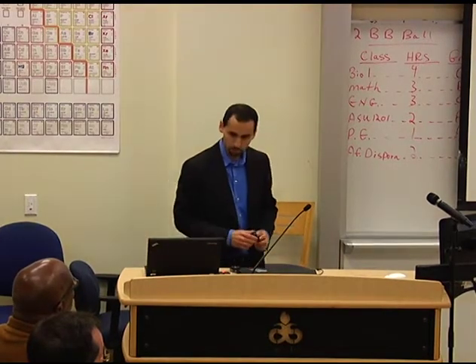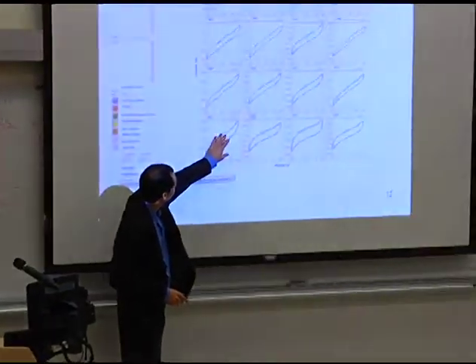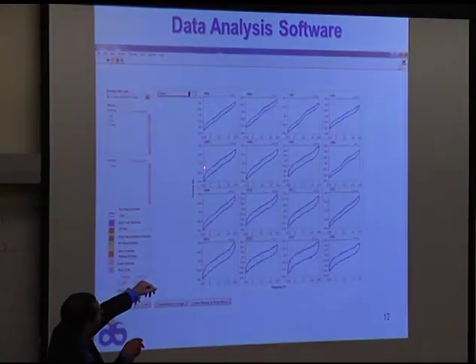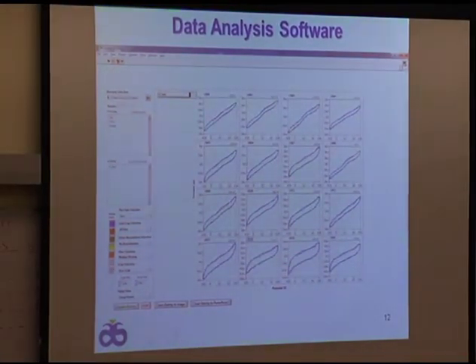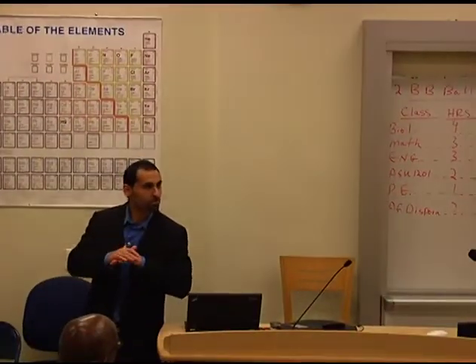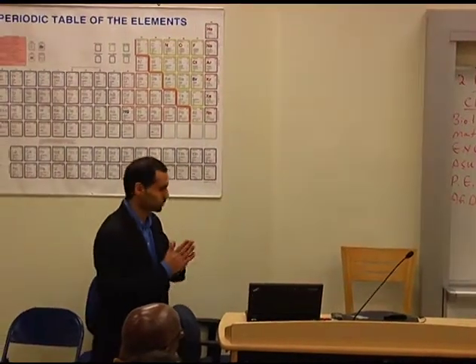We also did a test run, just a calibration chip, okay, running some simple CVs off a calibration chip with resistors, and each of these channels was working fine. So the potentiostat operates extremely nicely, and we can run all these channels simultaneously, basically 16 experiments at once.